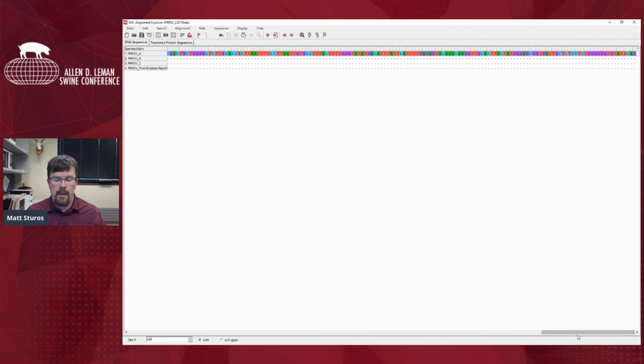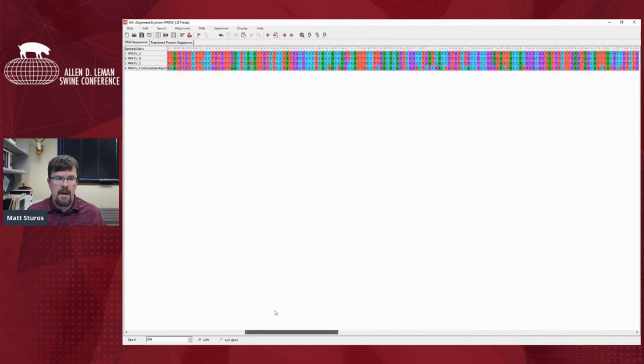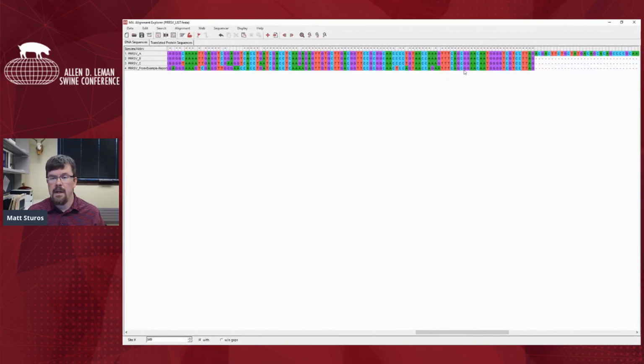And then what you end up with is a file that shows you where you might have some differences. I think maybe I actually had aligned this. But anyways, the idea here is you're going to get all of the ones that can line up to line up. Hopefully at position 603, that would be position 603 for all of the sequences. And so this would be how you create an alignment using Mega.